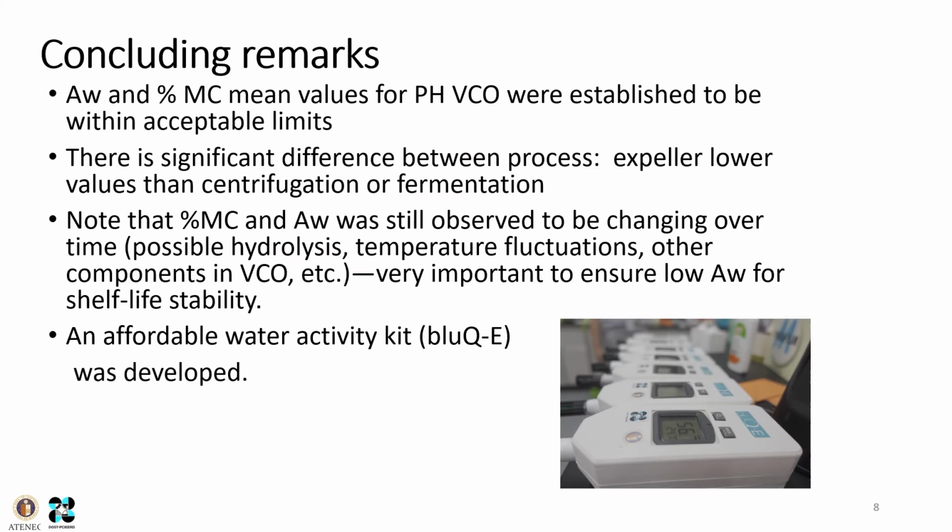As a quick summary, we have measured the water activity and percent moisture of many VCO products and established that they are within acceptable limits. But it's also important to note that there are differences between different methods of production. And it's important also that we monitor water activity because this is the one that will establish shelf life stability of the product.